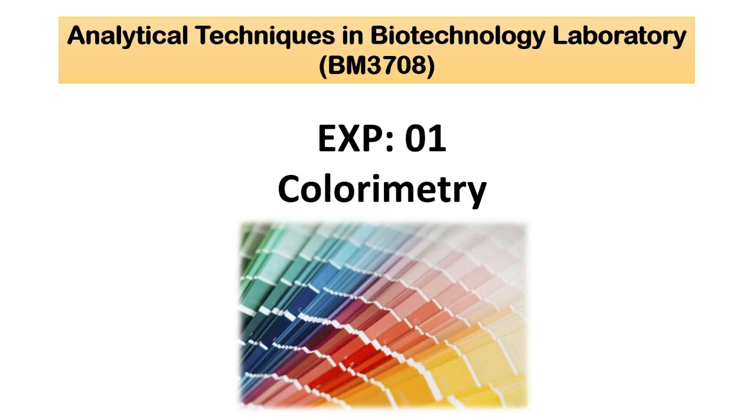These color bands are also associated with a wavelength: for red you have one wavelength, for green one, for blue one. When we go into spectroscopy, this wavelength scan increases. So that's why we will start with colorimetry.